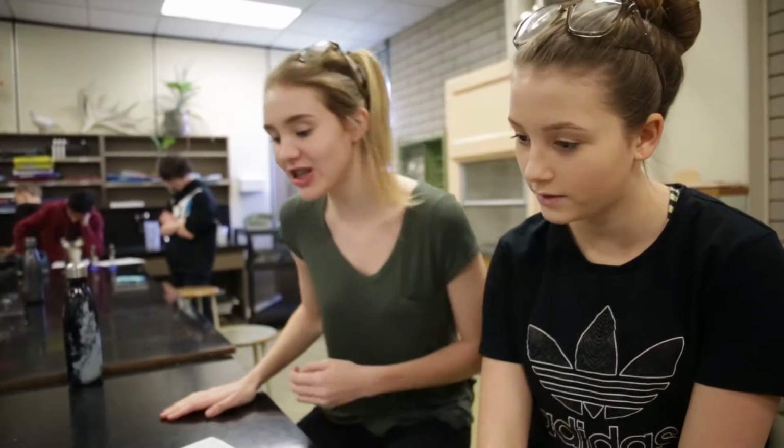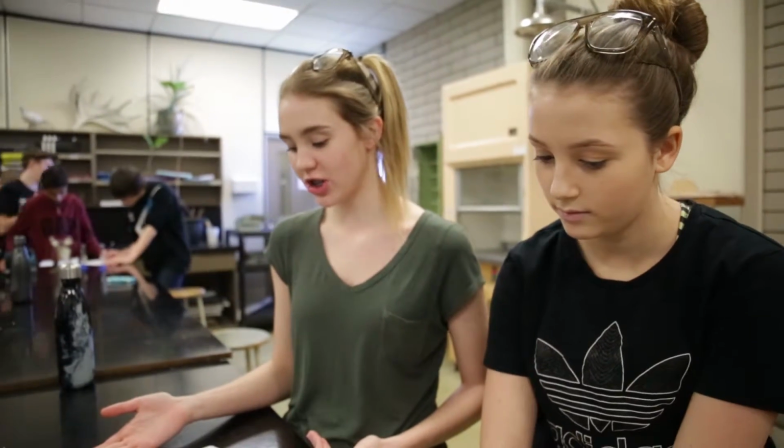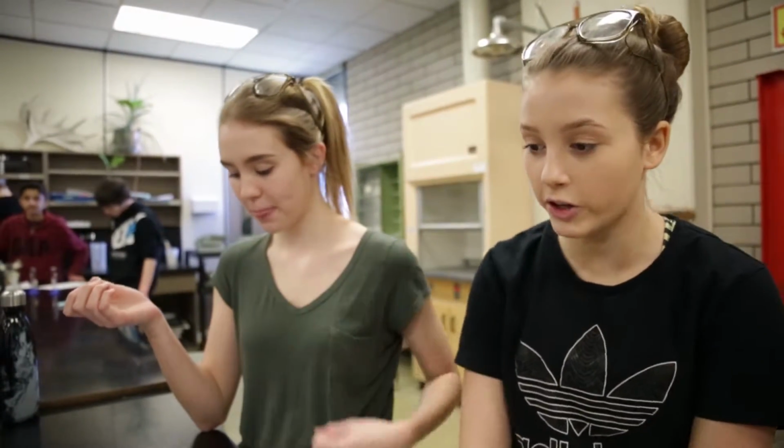So for solution A, we predicted that it would bubble and steam because we just thought it looked like water. And then when we started to boil it, it started steaming and then started boiling. And then it was spitting water to the top. It would spit and then settle and then spit again, and it would spit out of the beaker sometimes.